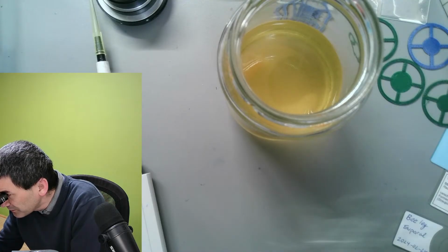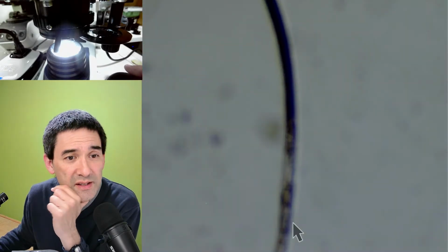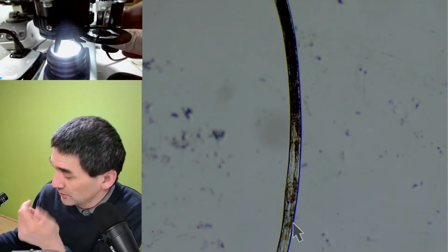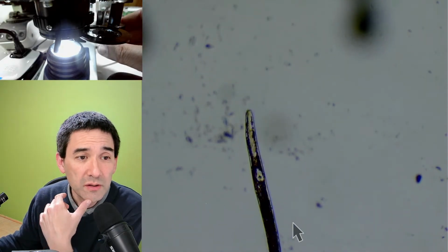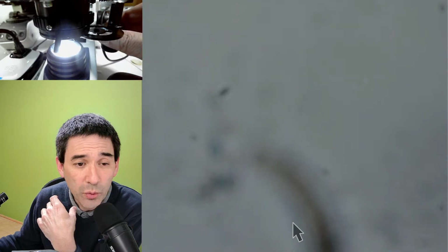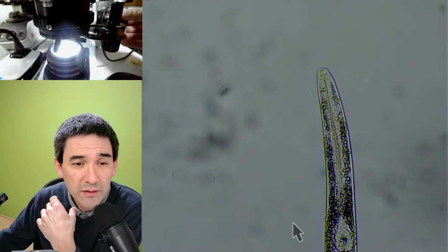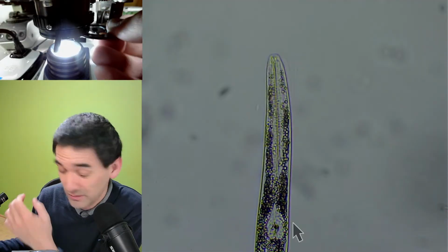Very good. I used very little water, so it kind of squeezed in a little bit and sandwiched. That's pretty good. So that's basically a regular bright field using my 4x objective. That's one of these nematode worms, a vinegar eel. Let's focus. It's blurry. So here we go. It's even pretty good in the bright field. Honestly, no complaints here.